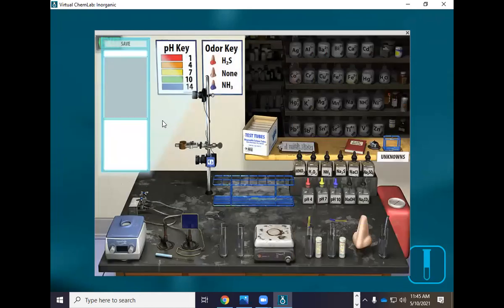Okay, so those are the procedures, how to use the centrifuge, the decant, the hot plate. I think that's all of the techniques. We don't get to use the smell one. It would be fun, but we don't get to do that. Nothing's gonna smell. Okay, so that's how you do this.